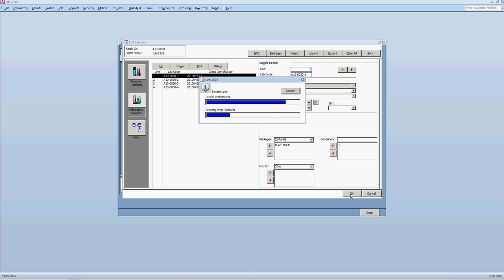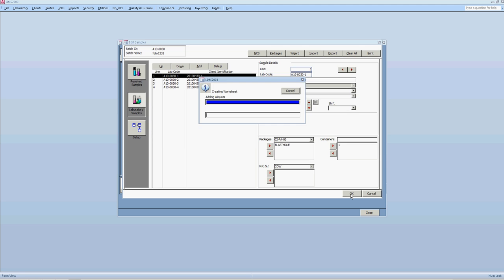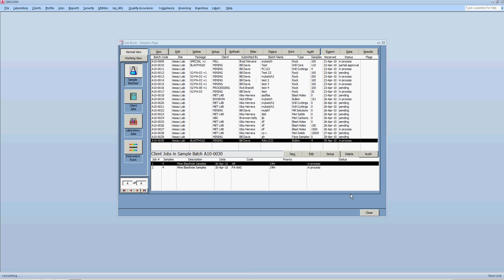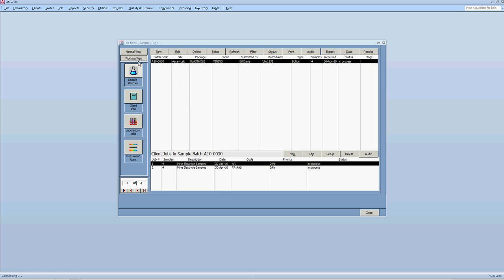Okay. And now all the different worksheets are going to be created for the analyst to start doing the analysis. Okay. So what happened there? Okay. Now the new batch, which name is here, A10030, has been created. And if we want to review how is it, normally we go working view. Working view.